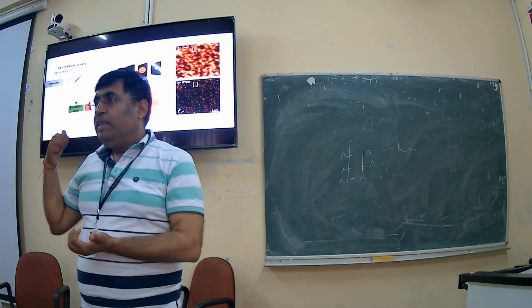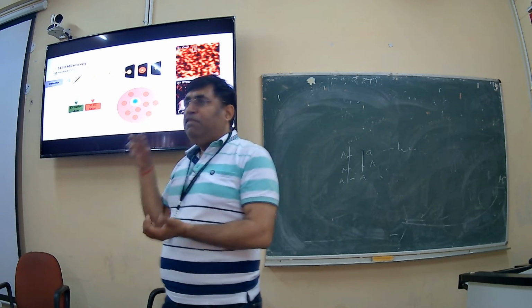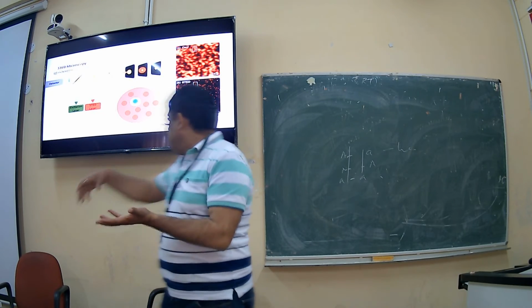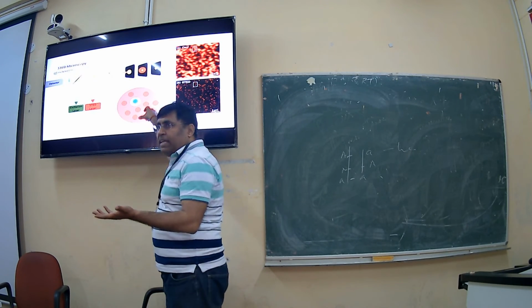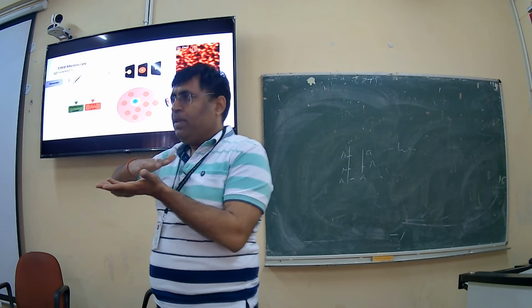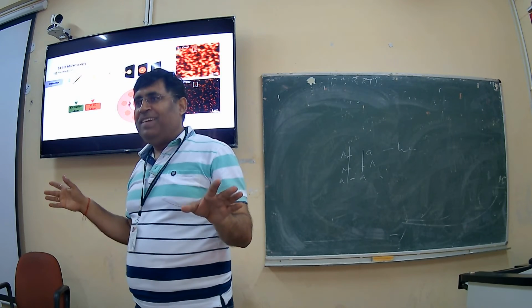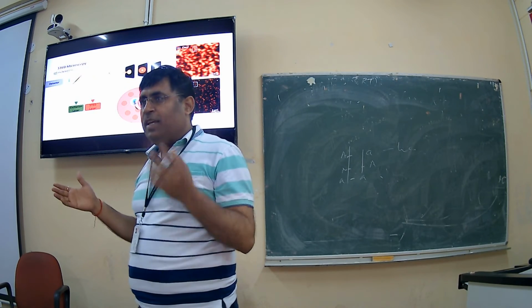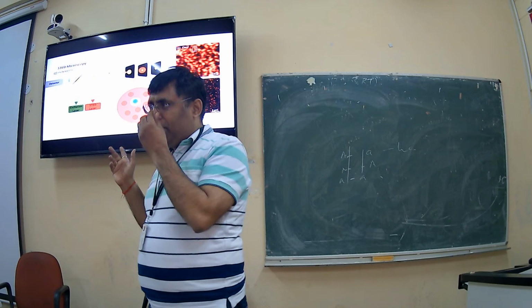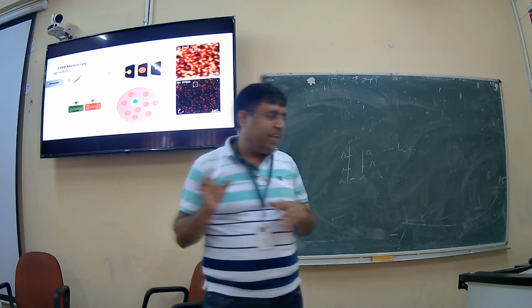In the same way, there is an extra laser beam which will bleach the other signal, and then it will capture the image, and this happens very quickly, so that you get better resolution. You got this point? Is it easy? It sounds easy, but actually it is complicated.